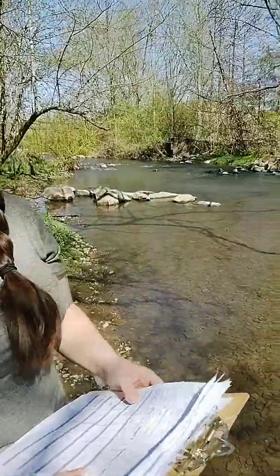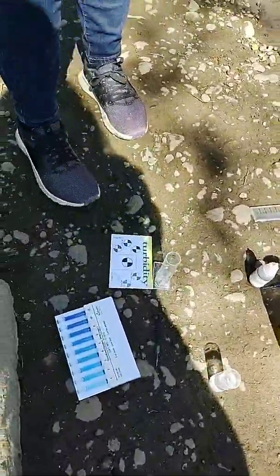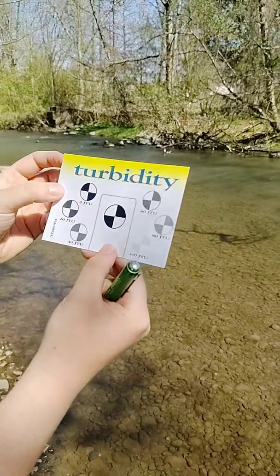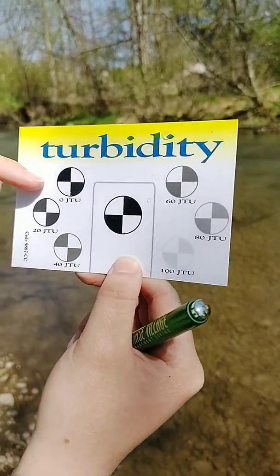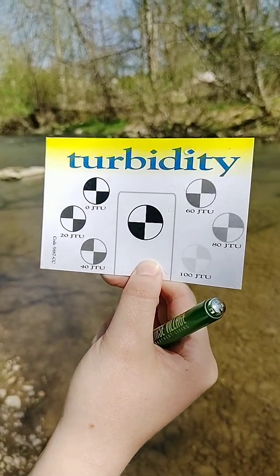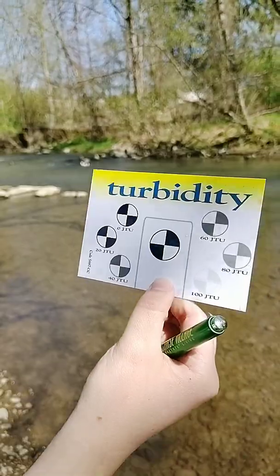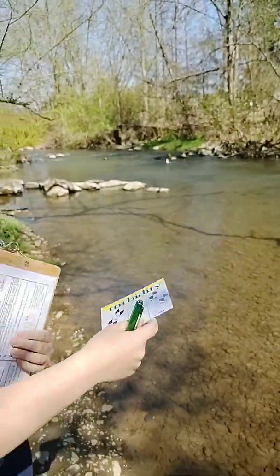And then for turbidity, I don't have a graph for that, but our score was 5 JTU. In general, I'll bring up this card here. You don't want anything to be above 10 JTU, so in between these two discs here. Anything above that is not considered inhospitable, but it definitely wouldn't be great for the salmon. And anything at 100 JTU would probably be inhospitable.